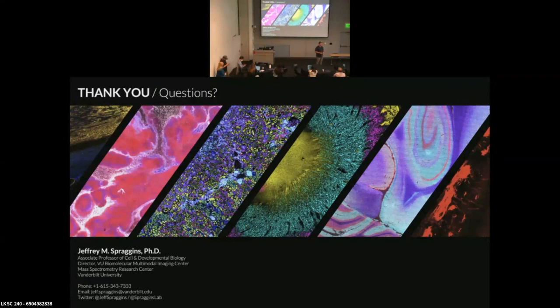It's for a couple of reasons. One, ionization efficiency for certain metabolites is going to be lower than lipids. So again, it's a competition for charge. And two, the mass spectrometers tend to have been built for proteomics, which means they're really, really sensitive from mass to charge 400 to 2000. And if you go outside of that mass range, now you've got to do some interesting things to tune them to make them work well.